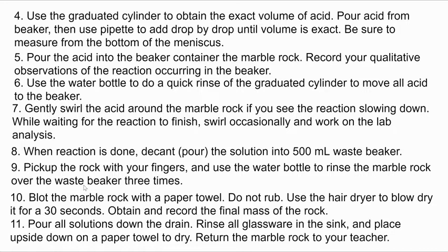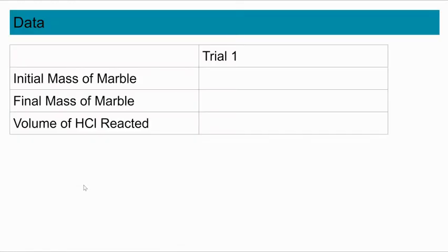And use a hairdryer to blow dry it for 30 seconds so that there's no water on it, and then obtain and record the final mass of the rock. To clean up, you can pour all solutions down the drain, rinse glassware in the sink, and place upside down on a paper towel to dry for the next class. So you'll need to gather the following data: the initial mass of your marble, the final mass of your marble, and the volume of hydrochloric acid that you reacted.